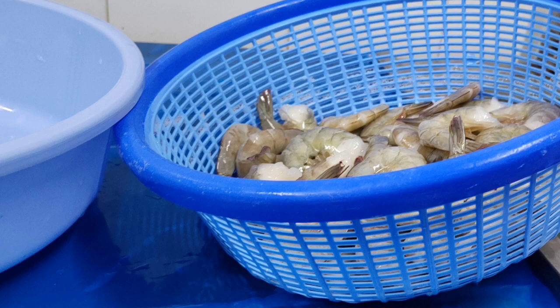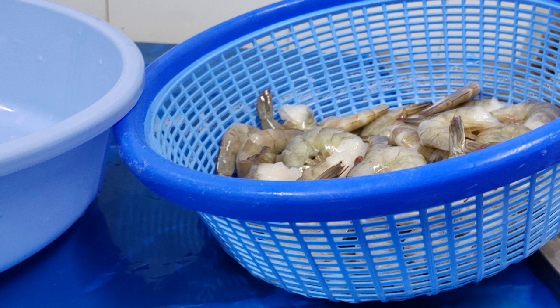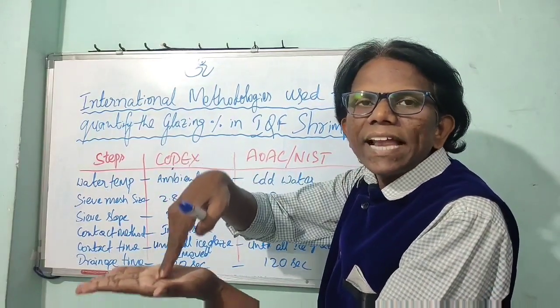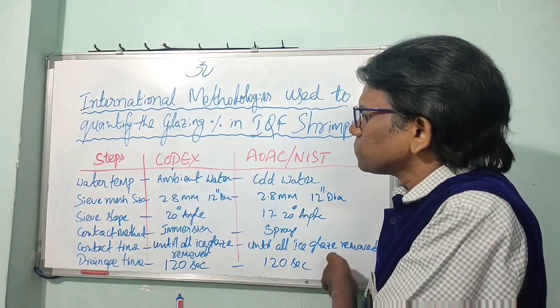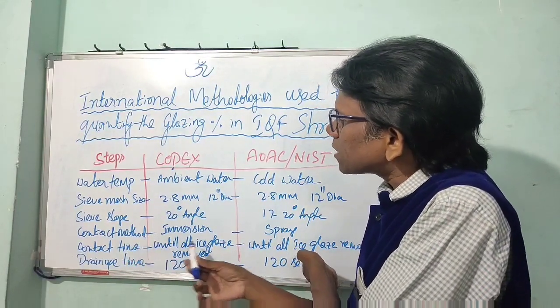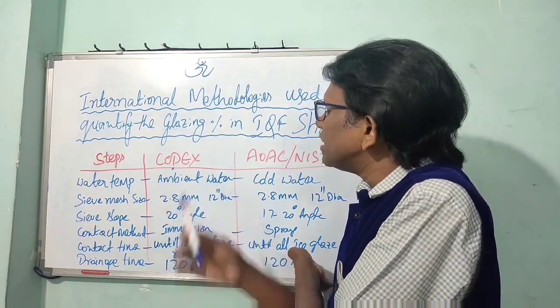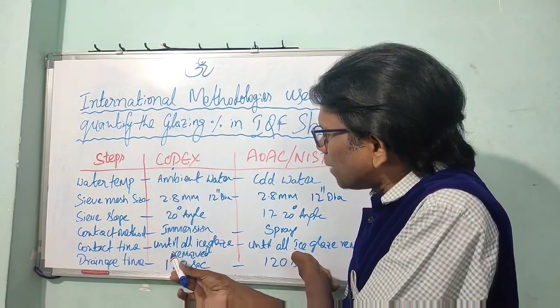Once you feel that the ice glaze has been removed from the slabs, you have to place the sieve in a slanting position at a 20-degree angle. The Codex method specifies that the contact method is immersion in ambient water, and the contact time is until all ice glaze is removed. You should not shake or throw the shrimps, and the drainage period is 120 seconds, or two minutes.